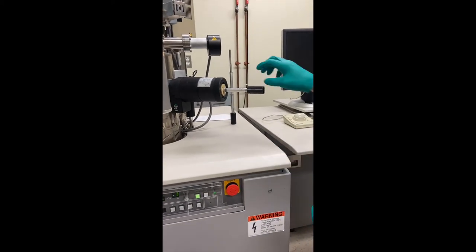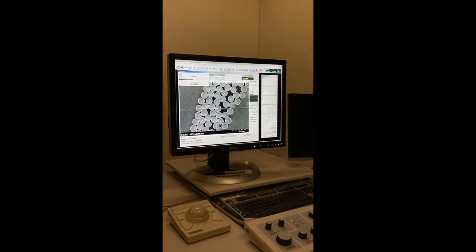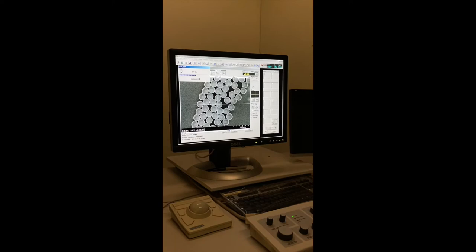Wow, amazing job, me. Alright, now that our sample is in position, let's turn on the vacuum and get searching.